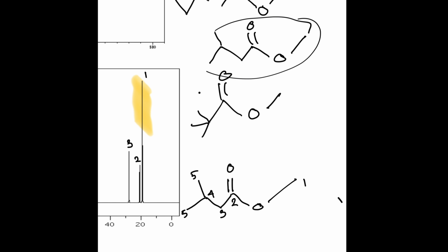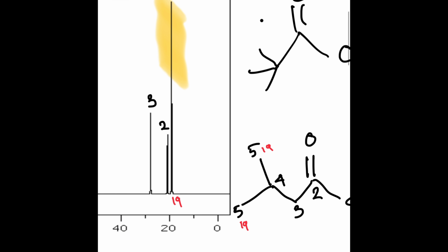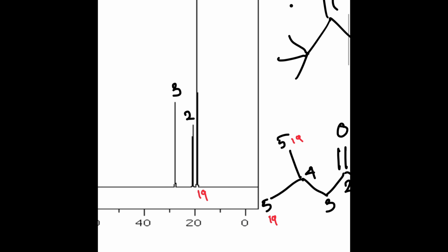And the ppm number of those carbons is going to be 19, as it shows here on the chart. It is at 19, just below 20 for that first peak. So the ppm values for these 2 are going to be 19. We're going to go now to peak number 2. Peak number 2 is at approximately 21 here. So we're going to have that as 21.